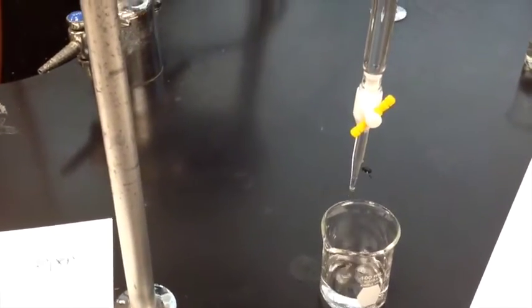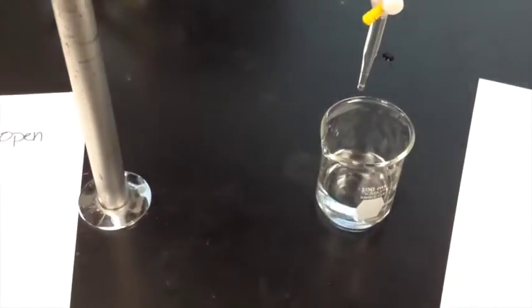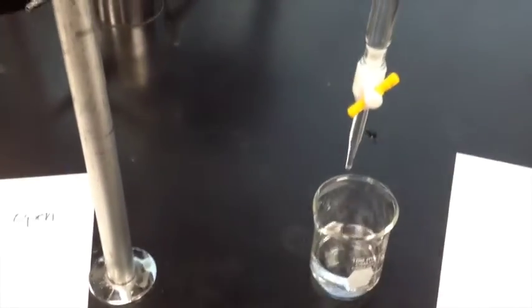Right, just a little bit at a time. As this is falling in, you're slowly trying to create a mixture of acids and bases to neutralize the two, to basically make a pH of 7 and an ionic salt. And that's it, that's a titration. Now we'll have to use an indicator or a pH meter to know that, but this apparatus here is how we're going to do that.